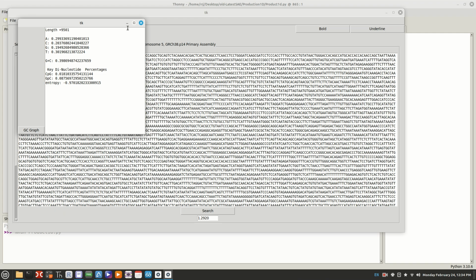Now here you might want to record this. Oh, you don't get this, sorry. Never mind. I will show you this in a little bit, but since you don't have it quite as easy, you can get it on bioinformatics.org. You can put the sequence in, but you can get the GC content, so that's G plus C. So this is for GPX8, and for this whole sequence that we collected, which remember has pieces before it and after it, is about 39.9%, I rounded up, G plus C.